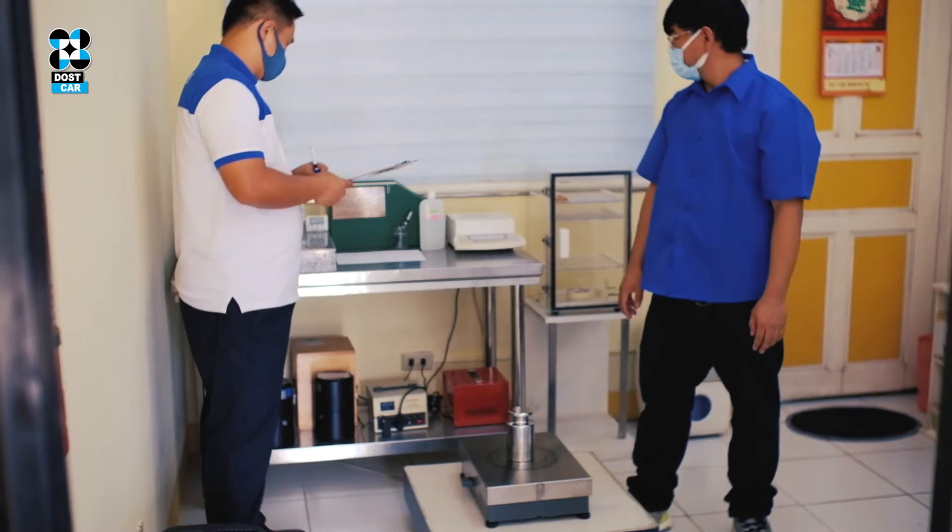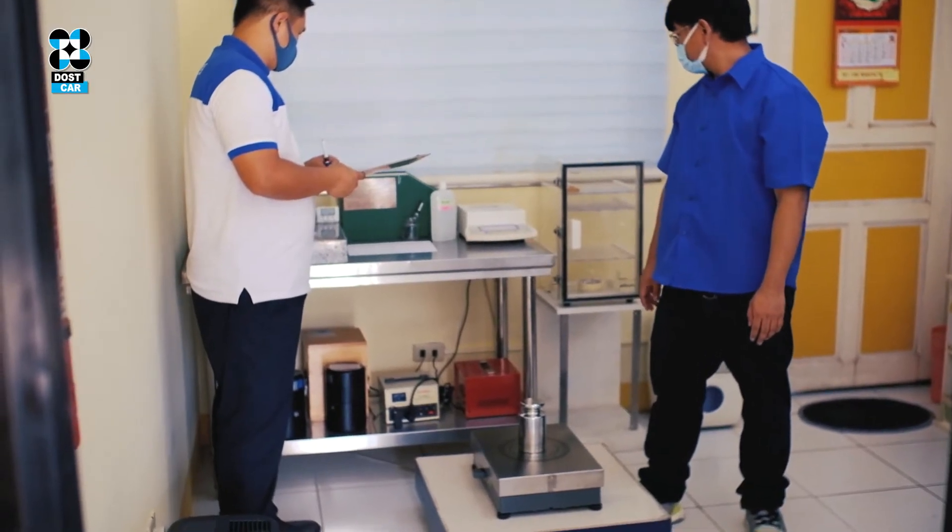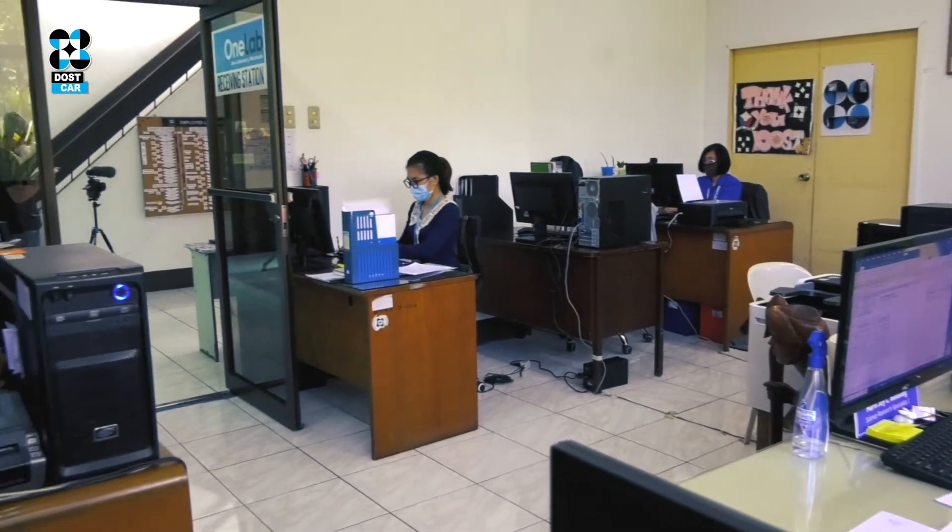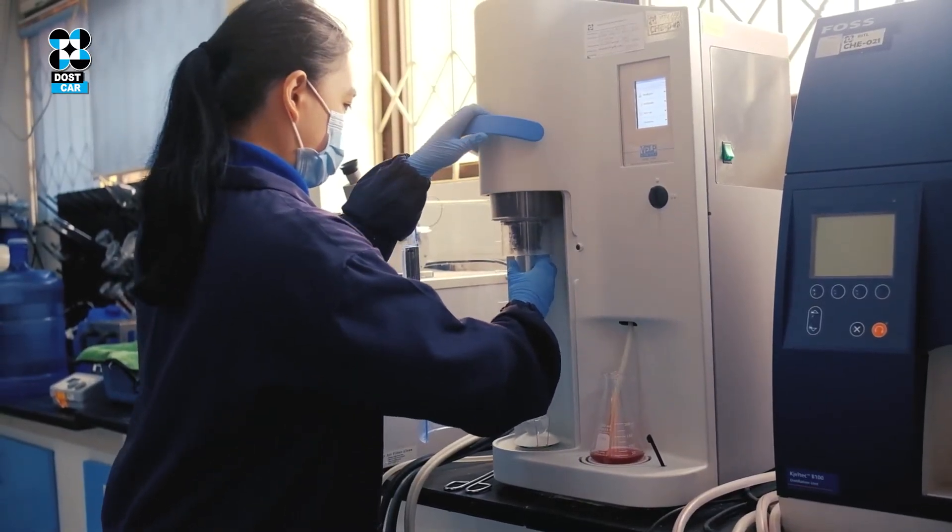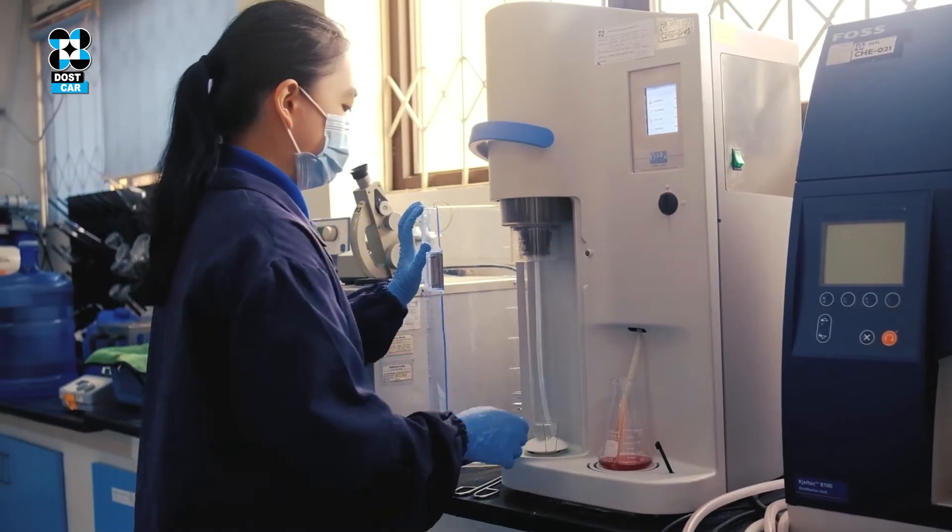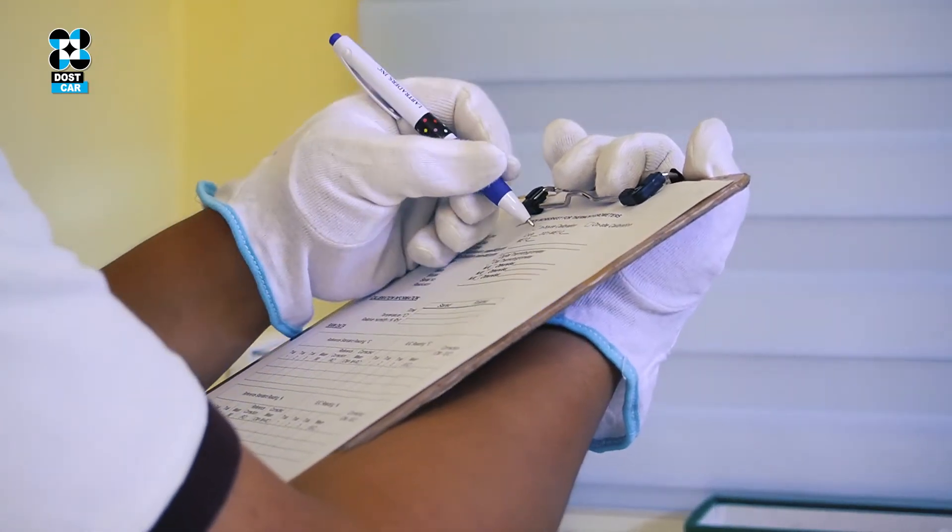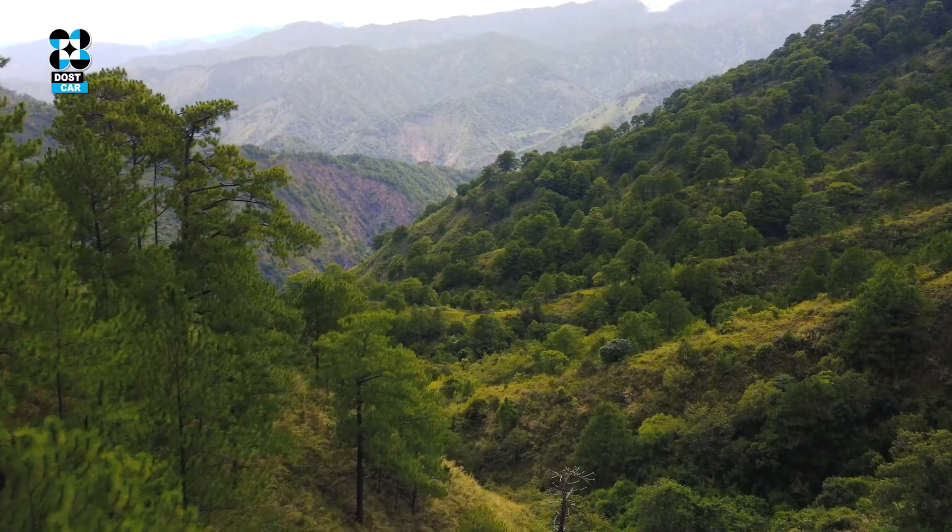The well-trained men and women of the RSTL continue to serve as beacons in enhancing the laboratory's operations and provide timely, accurate, and reliable services for customer satisfaction and confidence, especially in the countryside.